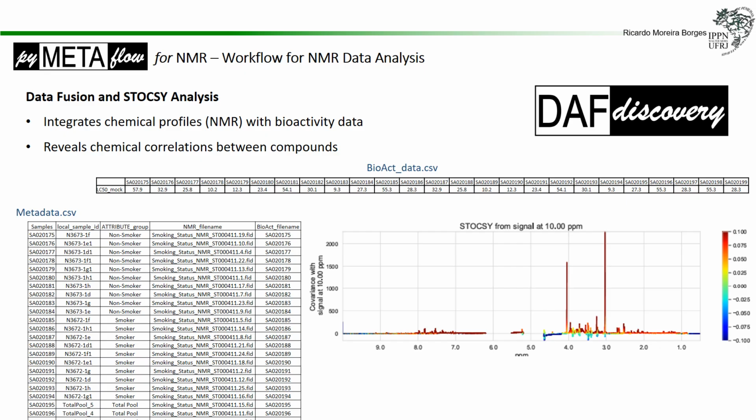So that would be another CSV file that will look like that, and in that table, there is a vector actually, where each column has a sample name, a sample code, and that code would be included in the metadata as a column for the bioactive file name.